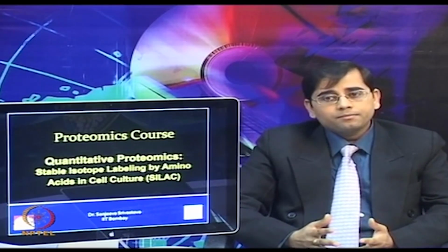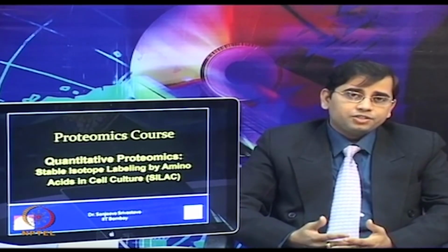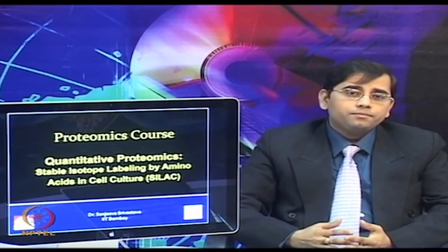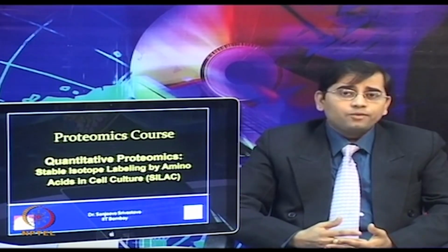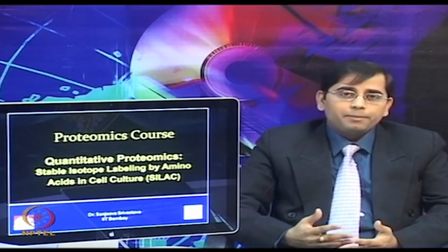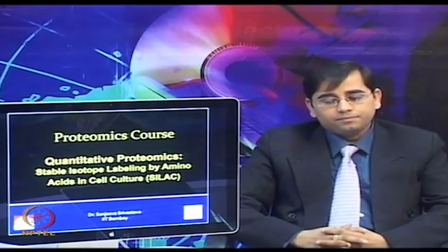Advancements in MS include the development of highly sensitive mass spectrometers, fast scan rates, automation, nanoflow liquid chromatography, as well as new techniques and methods to quantify proteins, their abundance, for quantitative proteomic analysis.